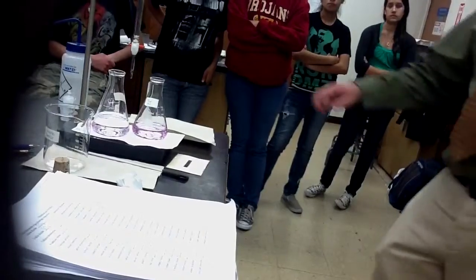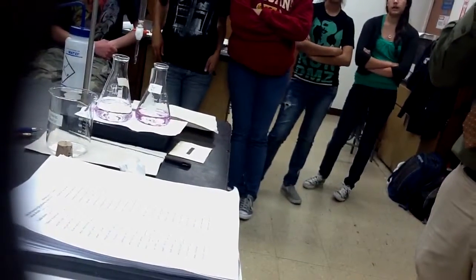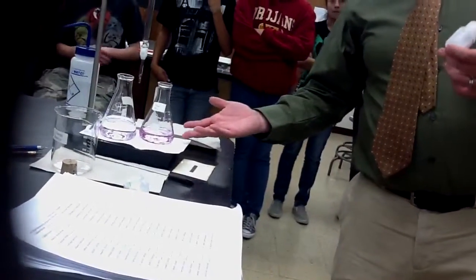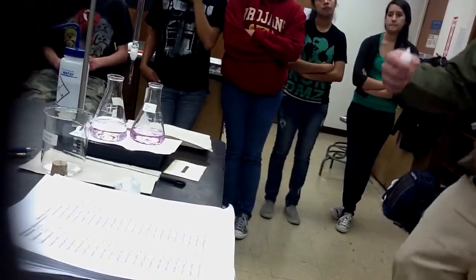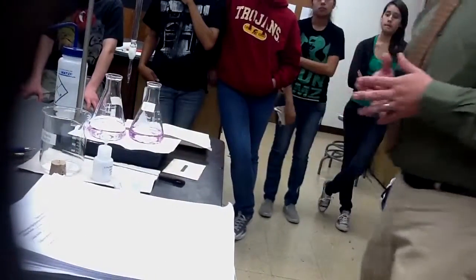When it was colorless, in this thing right here, it's basically in what type of solution? Is it basic? Acidic. That's why it's colorless. When it becomes basic, it turns what color? Pink. So how do you get it to go backwards then? If I added an acid to this thing, it would do what? Clear up. Right, it would clear up. So what type of acid is doing this then? It can't be the vinegar.